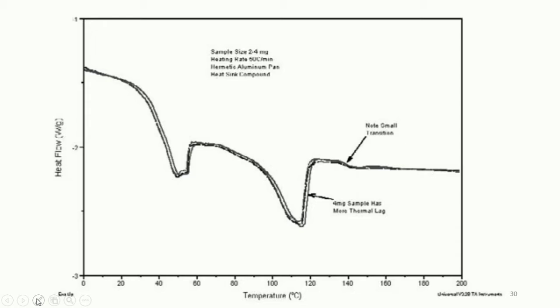This means that the amorphous drug and the amorphous polymer of the microspheres are completely miscible, and it is not possible to measure the amount of amorphous drug in the sample by differential scanning calorimetry. That is why another approach, such as thermogravimetric analysis, is needed.